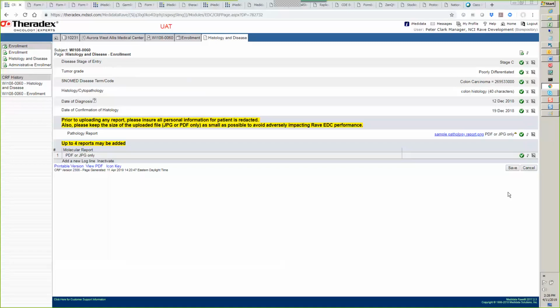So we would have a member of Diana Vuli's team reviewing what's been uploaded, and also, of course, checking to make sure that any private information has been redacted. If you guys notice something or you think that you're not getting what you need, then you would want to send an email to Diana, and if it has slipped through the cracks, so to speak, she would then work with the site to make sure that they uploaded the proper report.